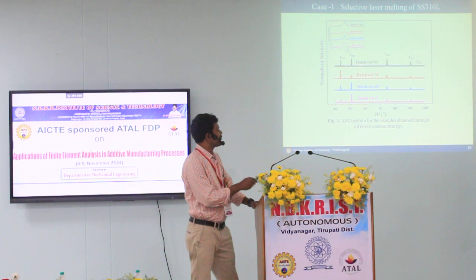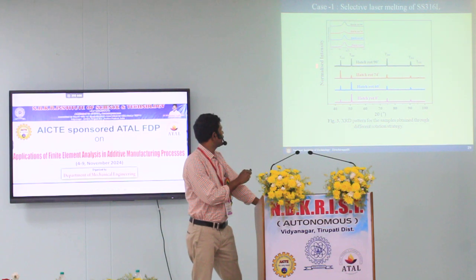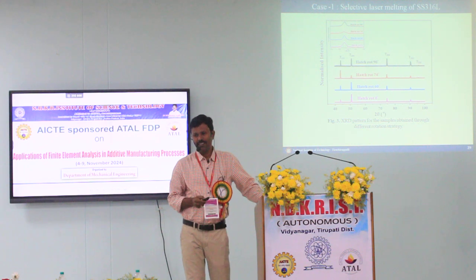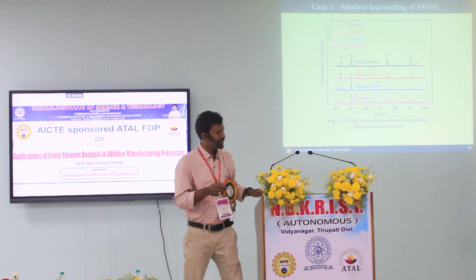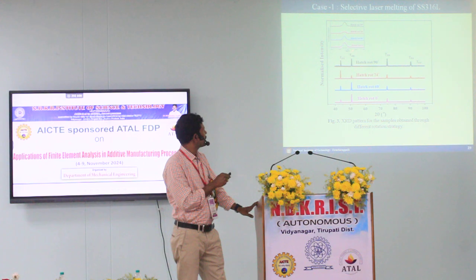This is typical X-ray diffraction analysis. It is nothing but a plot between intensity versus Bragg angle, we will call it the diffraction angle. Let's not worry much about this one. We are not dealing with the fundamentals of what it is. If you are able to see this kind of plot, you have to mark it. Without marking this, it's of no use.